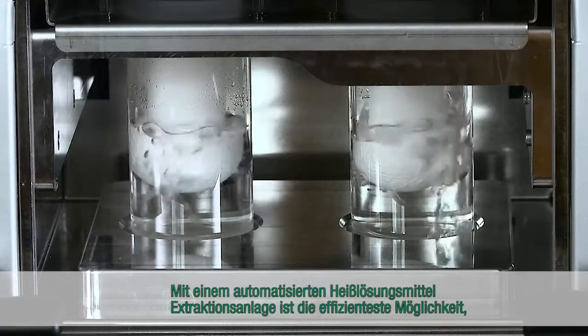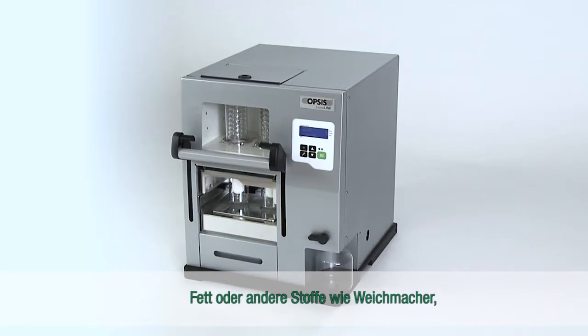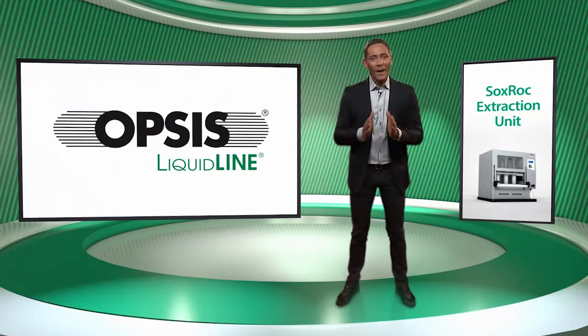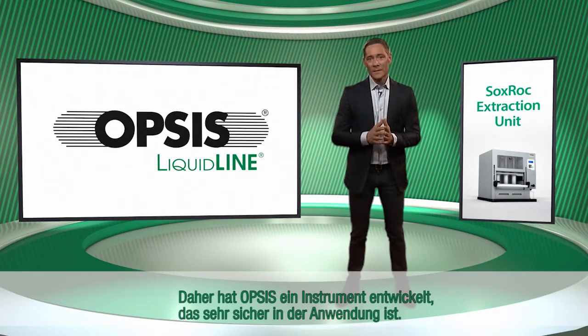Using an automated hot solvent extraction unit is the most efficient way to extract fat or any other matter such as plasticisers, toxins or oil. However, many solvents used in this process are flammable and toxic. Therefore, OPSIS has designed an instrument that is very safe to use.